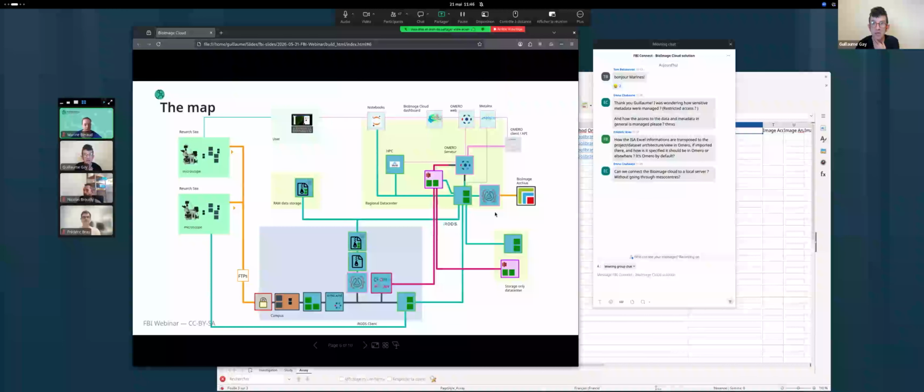Here, as the data is exposed on the internet through a login, but from everywhere on those endpoints, we can't guarantee a super high level of security. But it should be safe enough, at least for your research, so that your colleagues won't spy on you. This we guarantee.